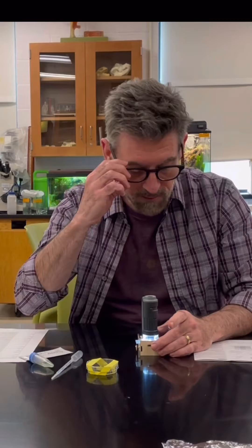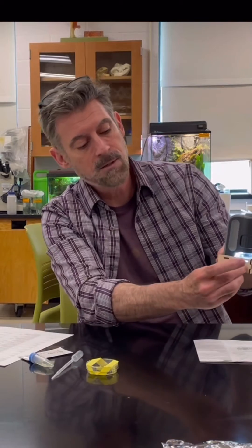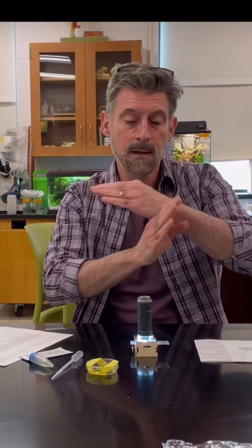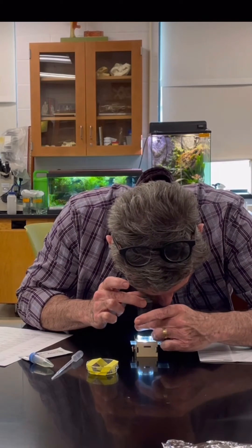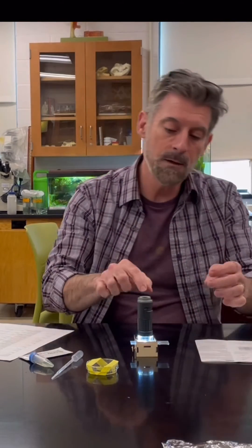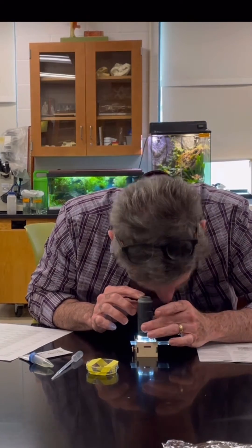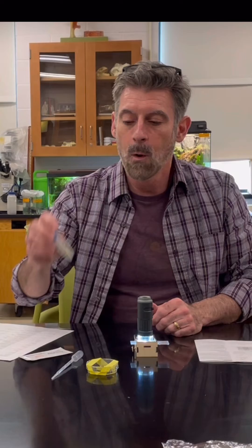Look through the eyepiece first and adjust the light - it should look really bright. If it looks dark, turn the knob to angle the mirror so it's reflecting light back up through. Move it around until you see what looks like a grid - hashes. Then use the focus ring to focus. I'll have a separate video where the focusing looks very clear. If you want to zoom in, hold it in place and use the zoom knob. Note that you'll have to refocus after zooming - it won't stay perfectly sharp.